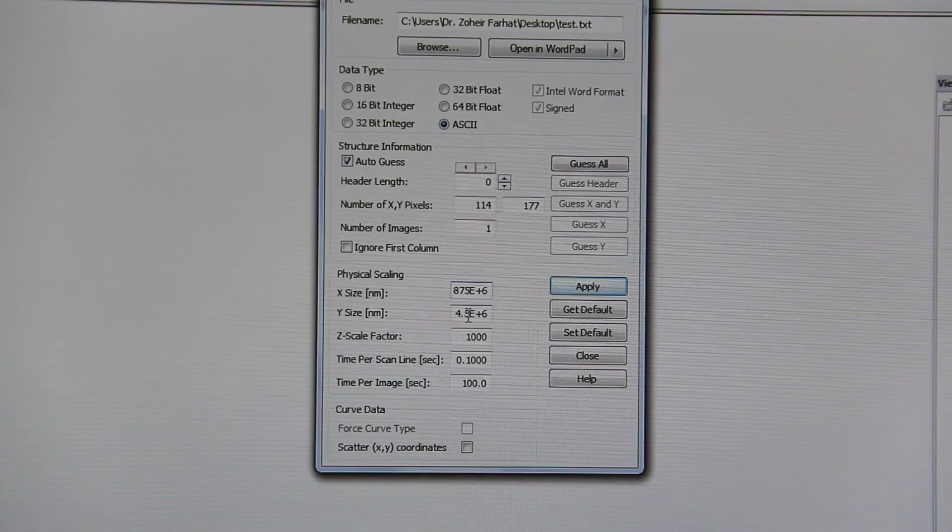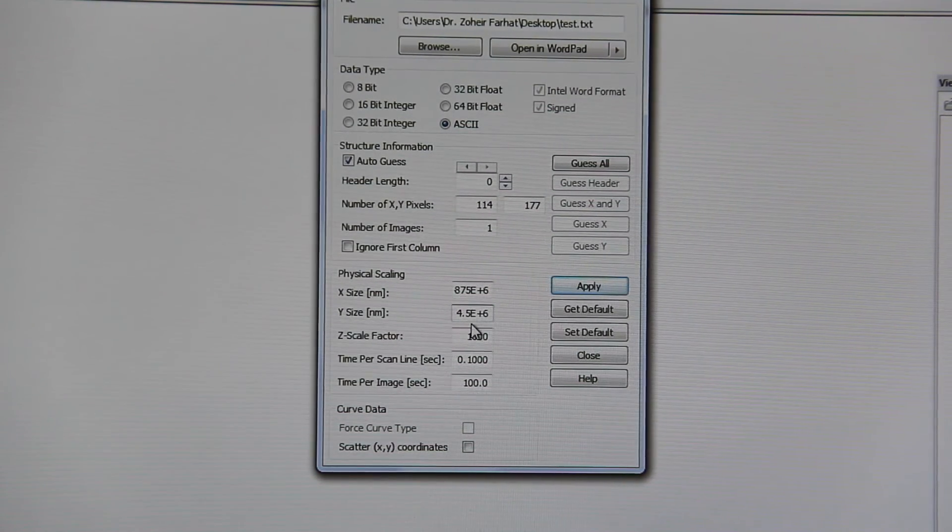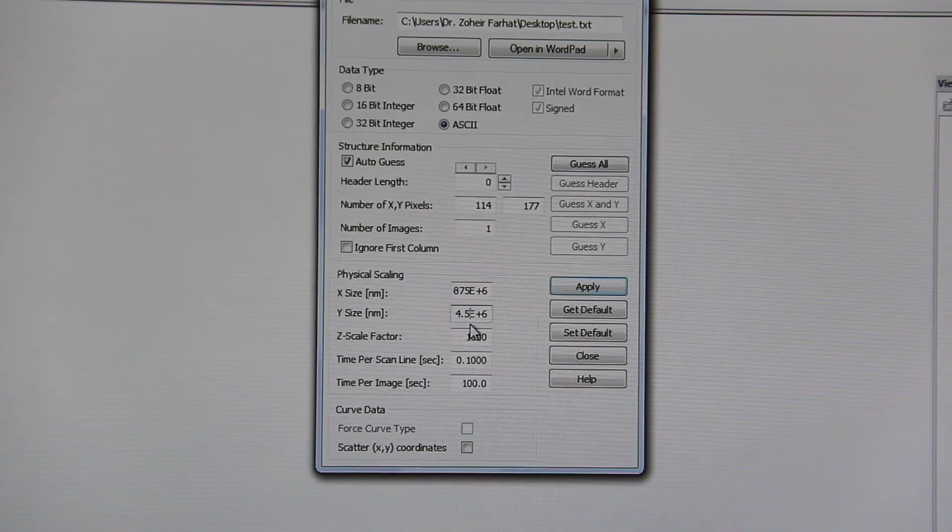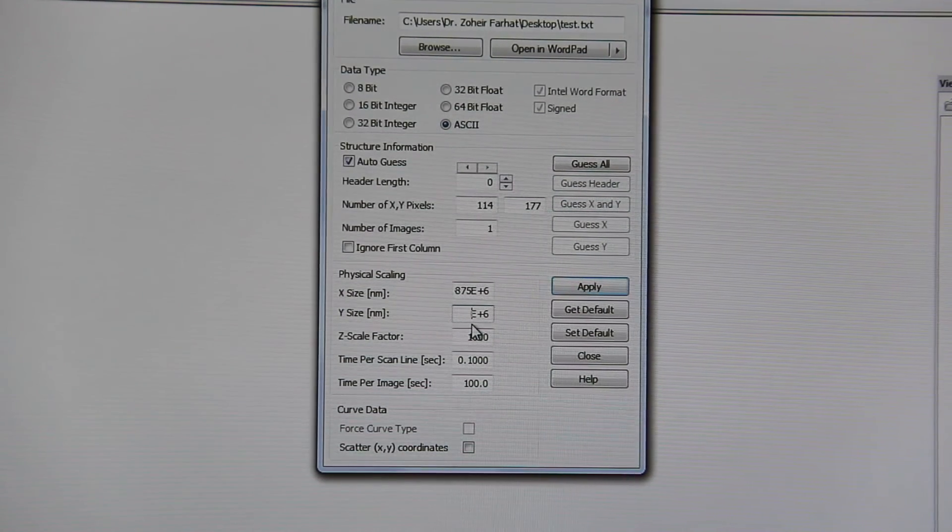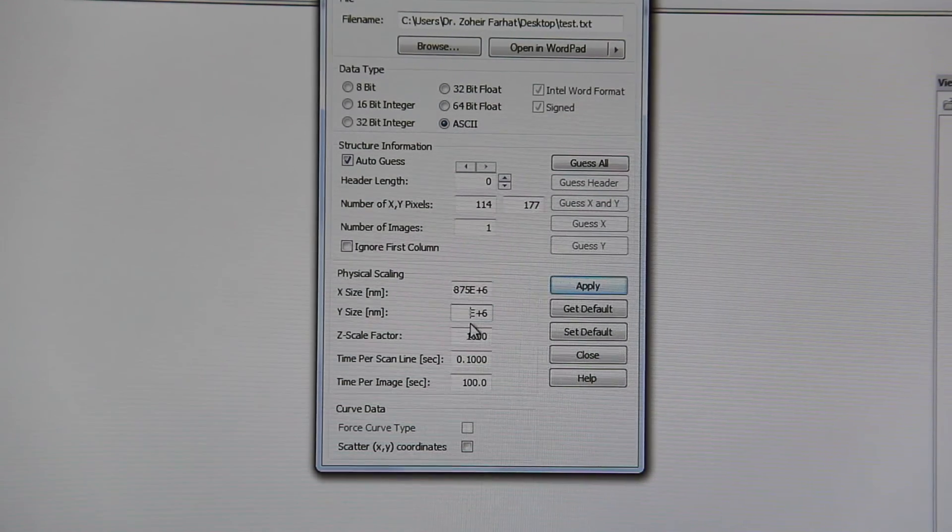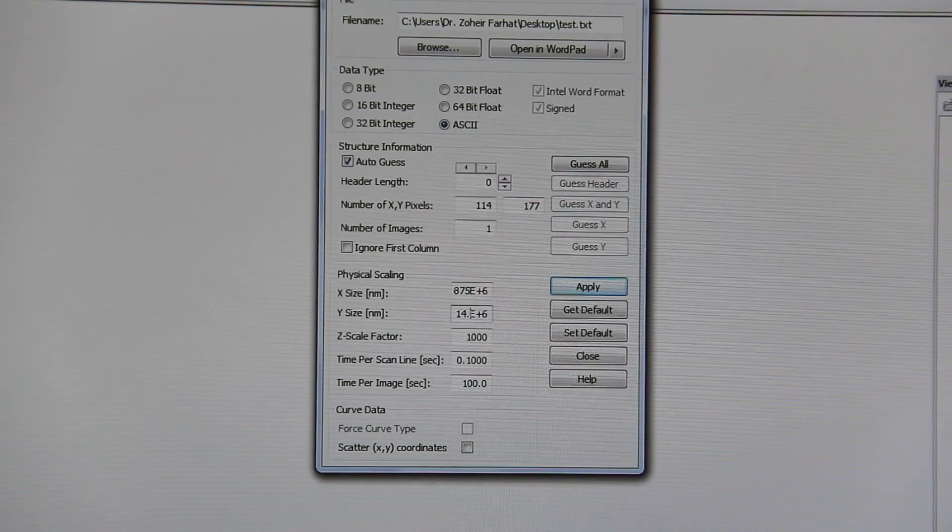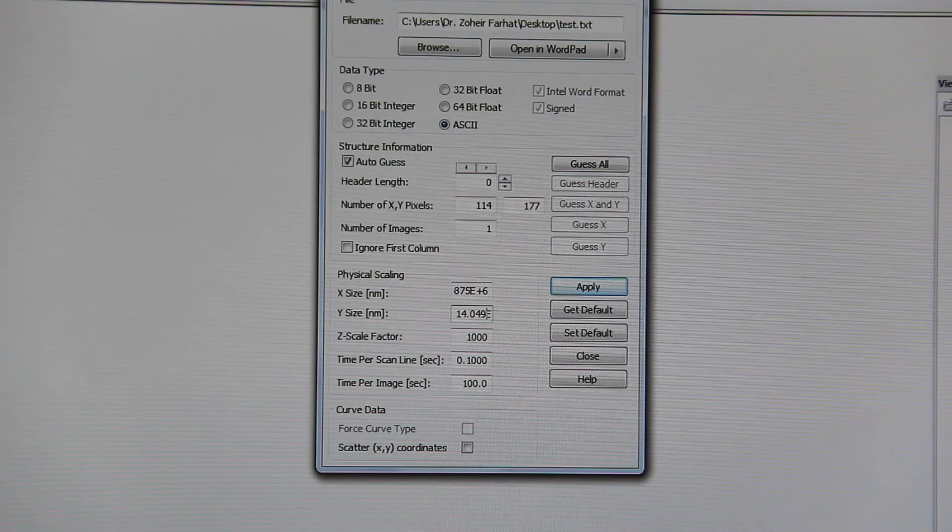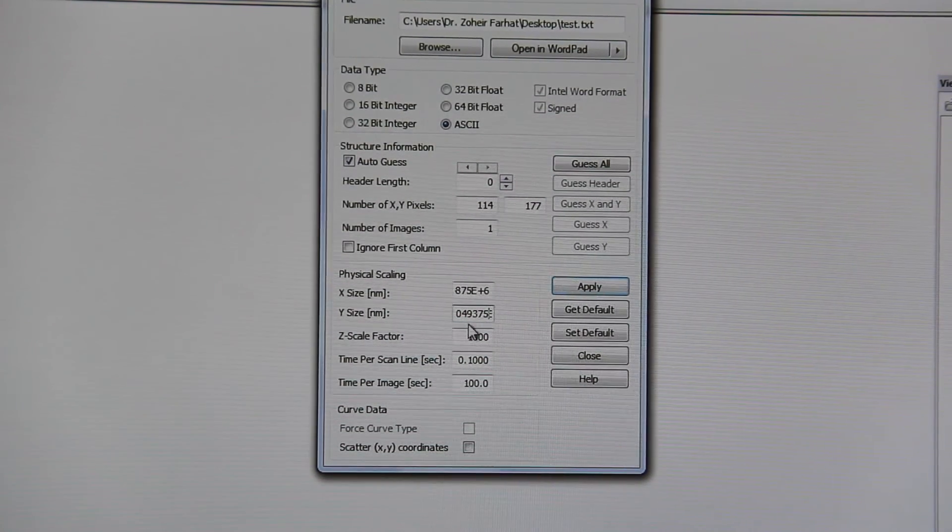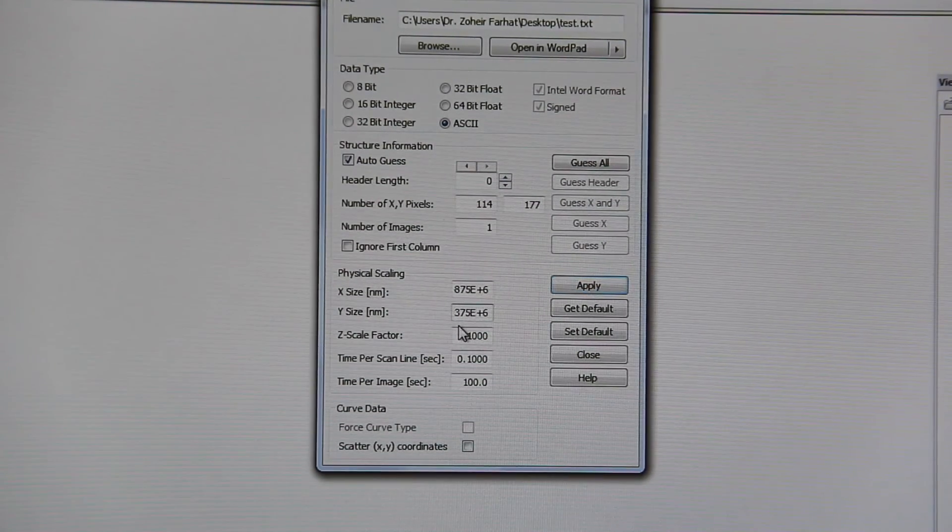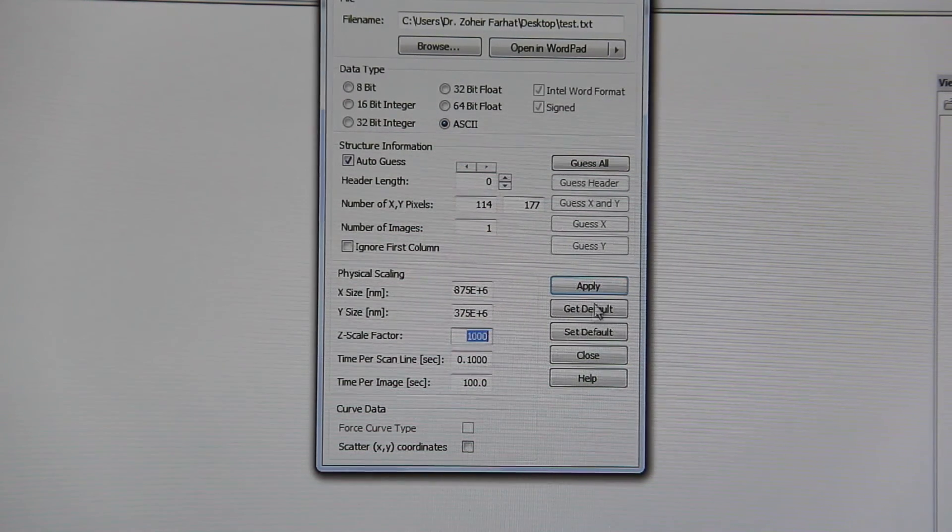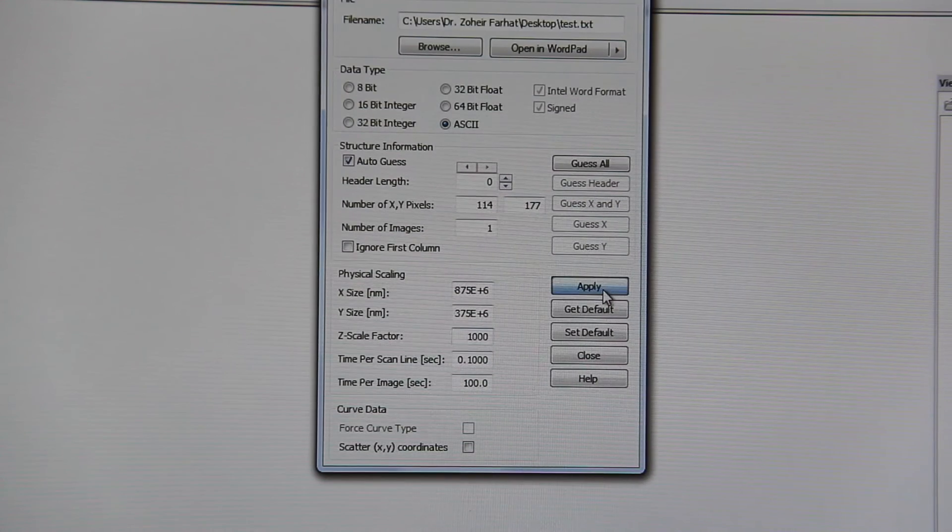And for Y size, it will be the same as 177 multiplied by 3.175 multiplied by 25, so it will be 14.049375 e to the power 6 nanometers. Z factor should be 1000. And then hit apply.